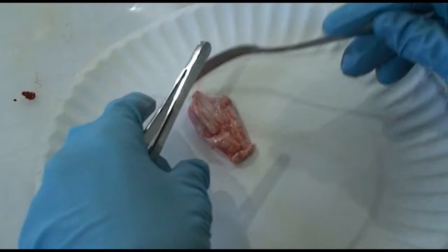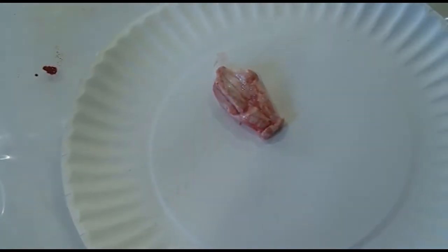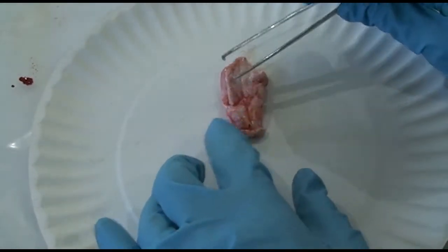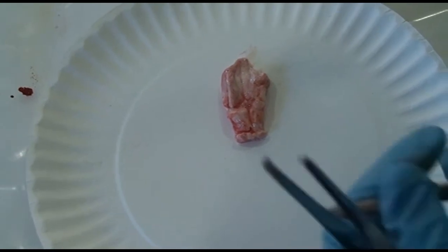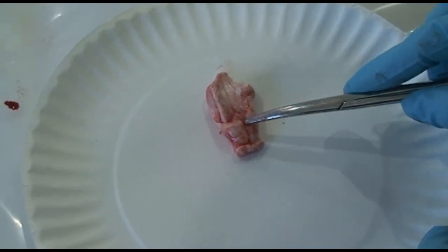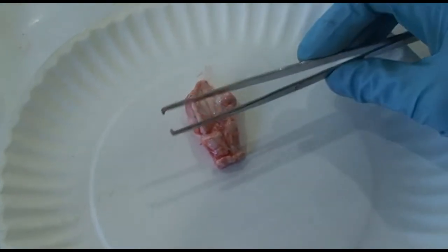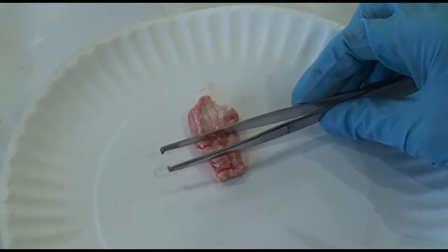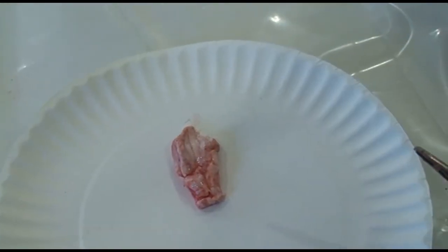And that's the brainstem. So the obex part is actually from this V section right here. You can see a V right there. And from a couple millimeters below the V to about a 9 millimeter swatch, about like that, is actually the obex, the section that they want.